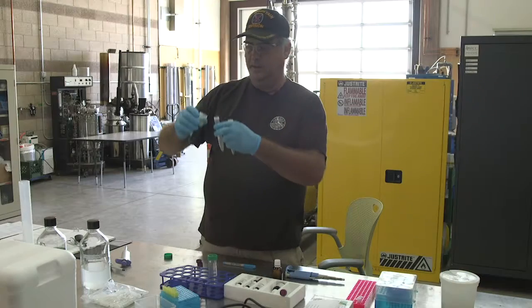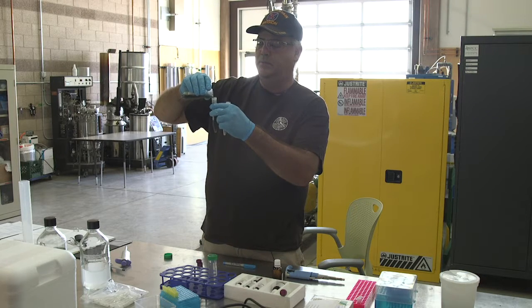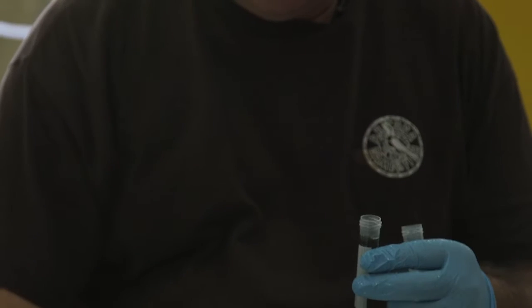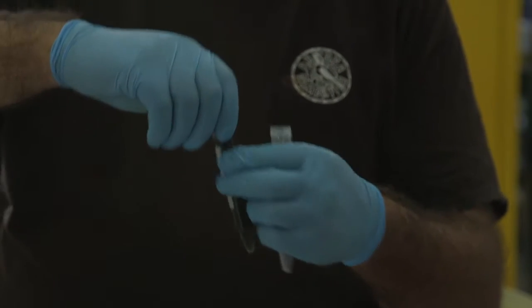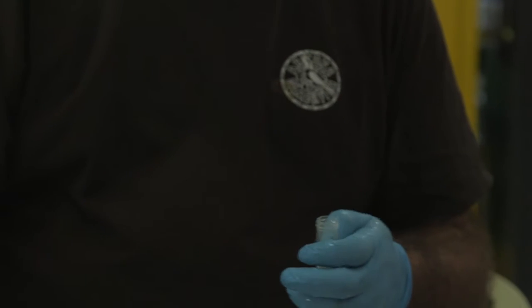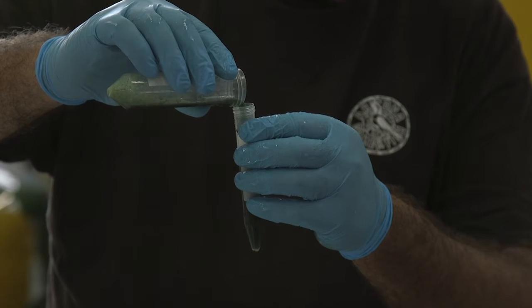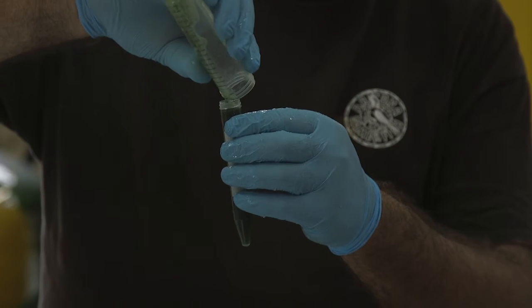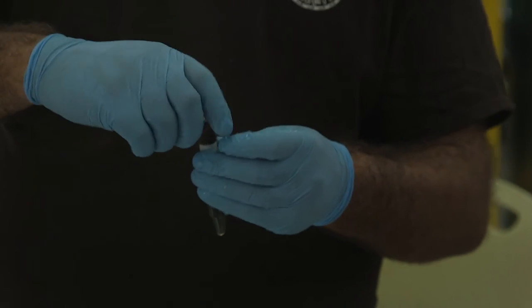Then we put the rehydrated ground-up spirulina in the smaller tubes so we can centrifuge them. You can do it in a 50 ml tube if you have a big enough centrifuge, which we don't, so we have to put it in the smaller tubes. And then we're going to use this to fill our tubes.